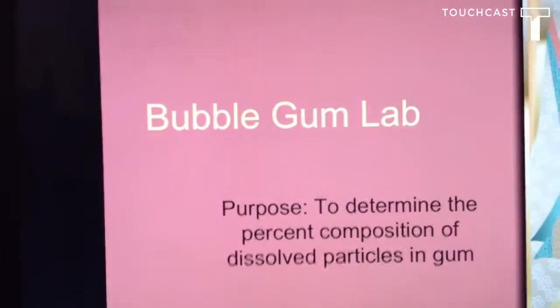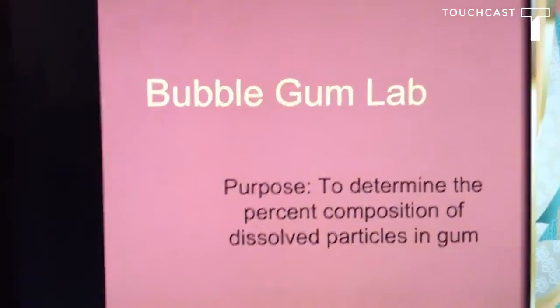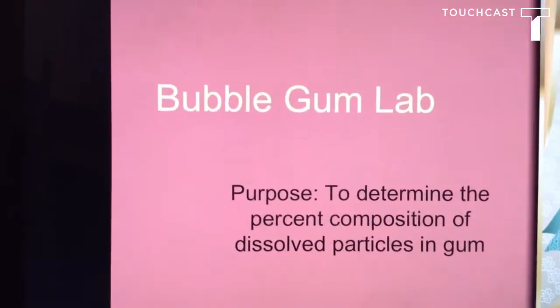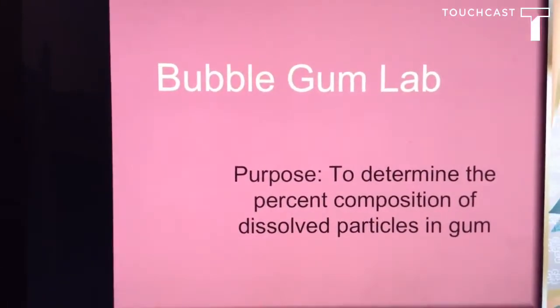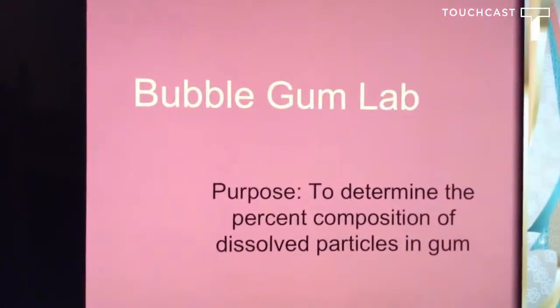We're going to do a percent composition lab. We're going to do that with bubblegum today. Your purpose is to determine the percent composition of dissolved particles in gum.